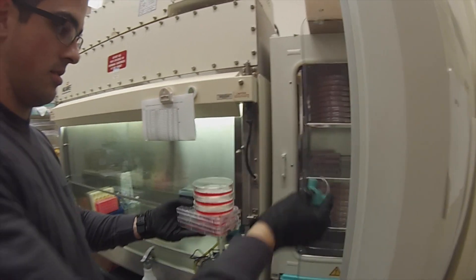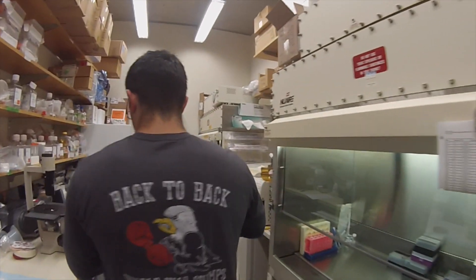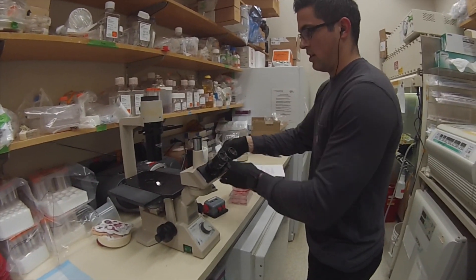These are all my cells. We just double-check really quick to make sure.